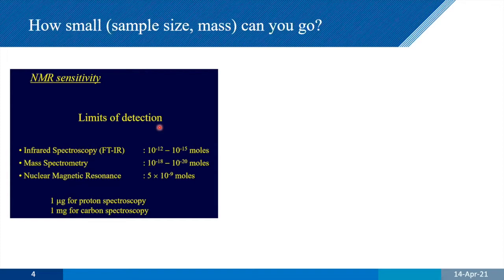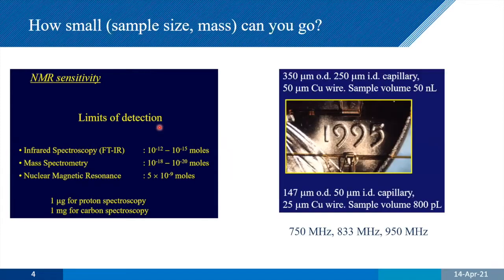So if you've got a sample and you want to run a high resolution NMR spectrum, people will tell you you need 5 nanomoles, and it's going to take overnight. So we thought, let's try and address this issue. So we want to go to very high field. We have access up to, say, 950 megahertz. Now we can go over 1 gigahertz.